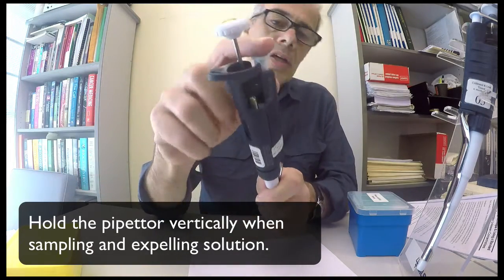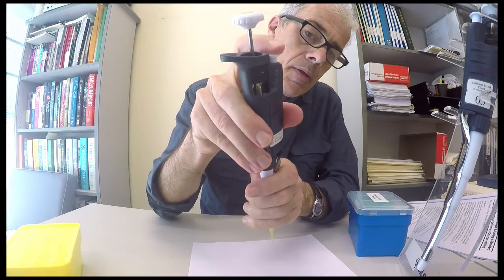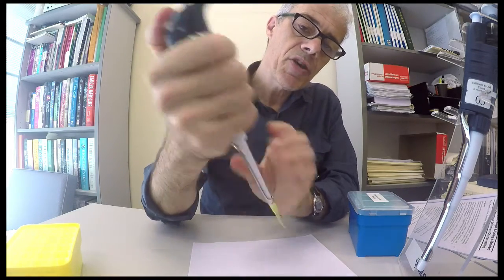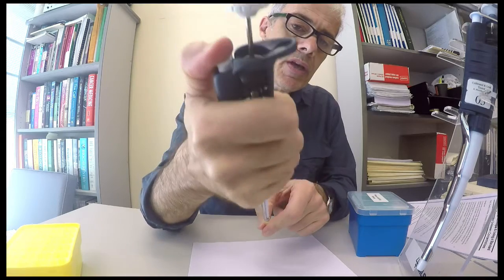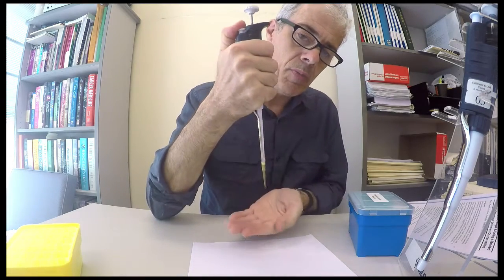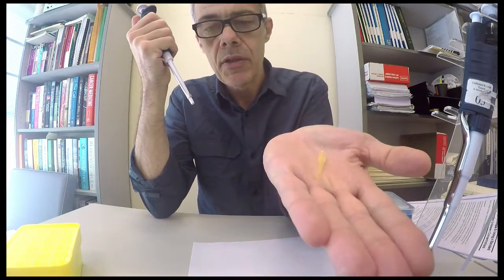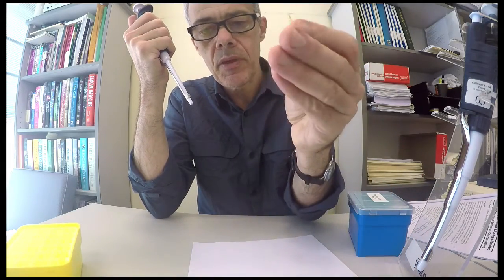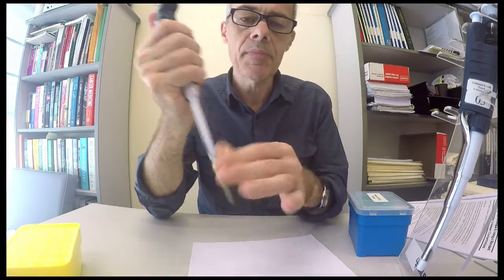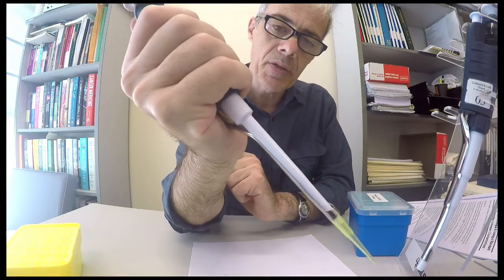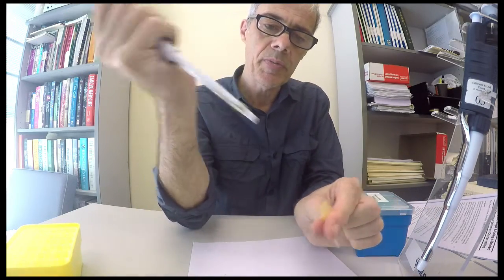To remove the tip, there's a button here. If you just put a bit of pressure down on your finger, it'll just pop the tip off. So there we go. So normally you'd have a waste bin and you would just dispense your tip into the waste bin.